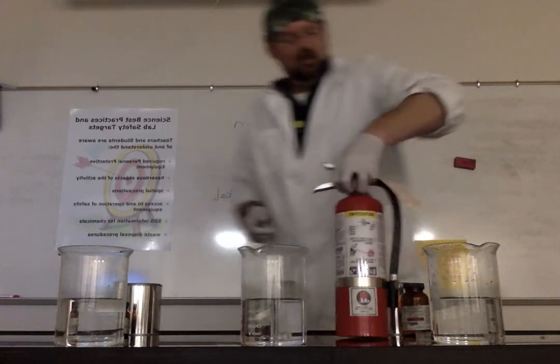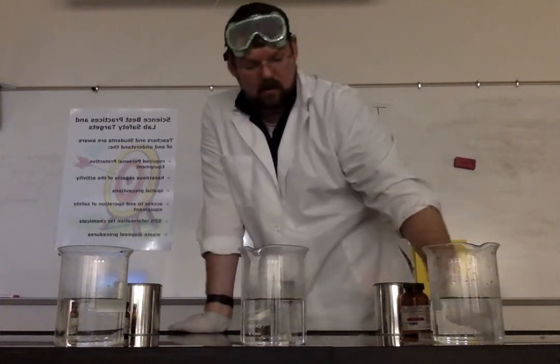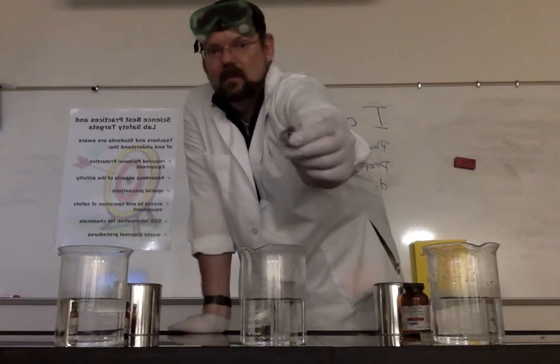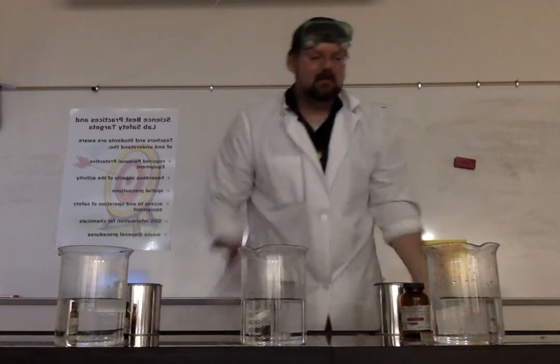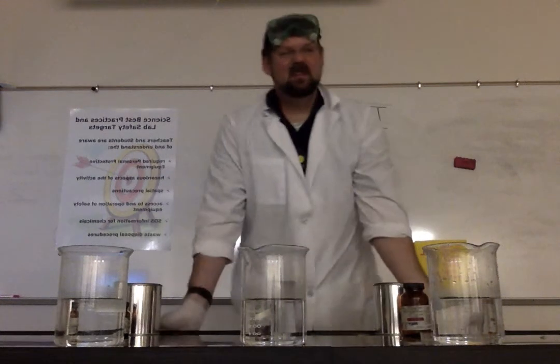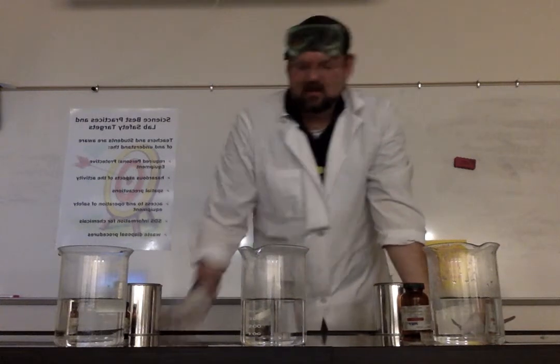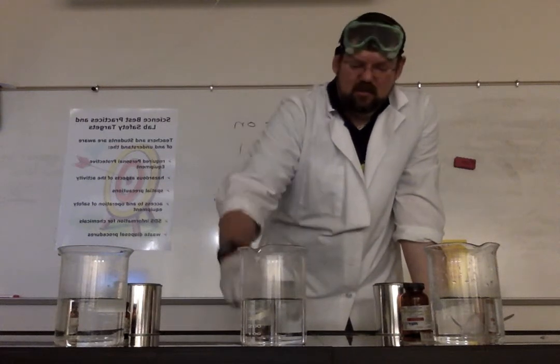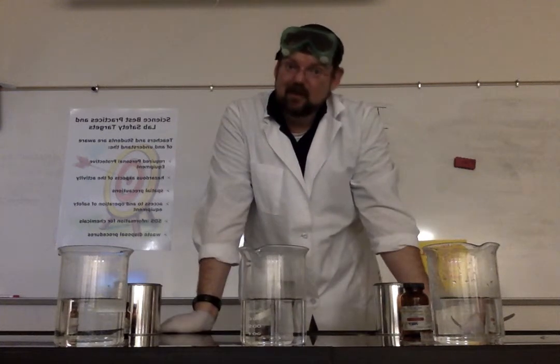The alkali metals that we're using are going to be lithium, sodium, and potassium. Now, on quick inspection, you're going to say, well, I don't know, they don't really look like metals. Well, it has a hardness to it, but they don't really have the color. That's not really what we would expect, especially if I look at sodium. Sodium's kind of a whitish color, with weird shapes. Maybe not so much a metal. Well, I'm telling you, they're actually metals.